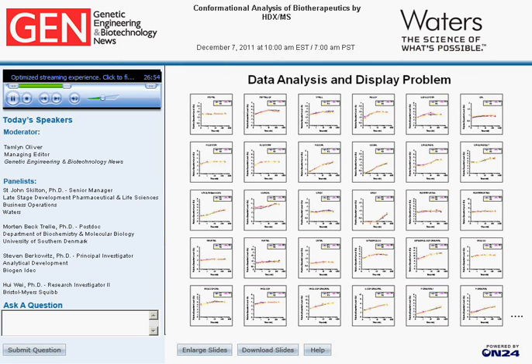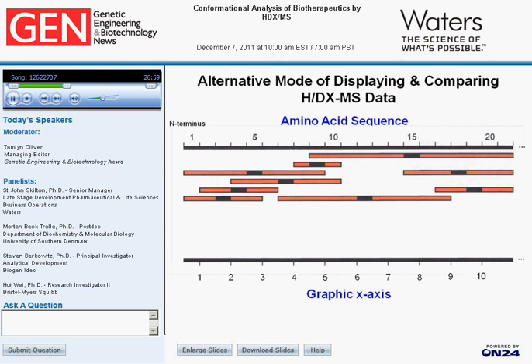So what we're trying to do to simplify this process is we go back and we line up these peptides again relative to their amino acid sequence position in the protein, as indicated at the top. So those peptides are aligned. Next slide.